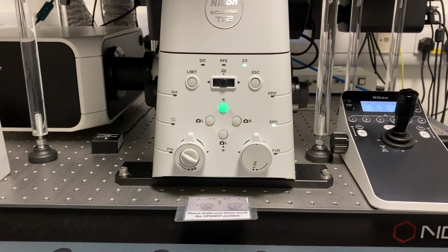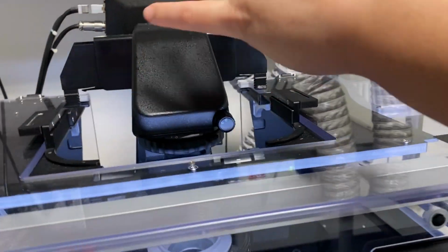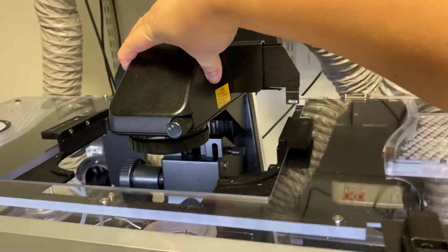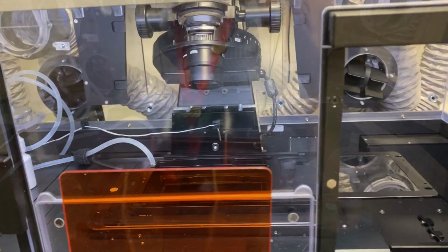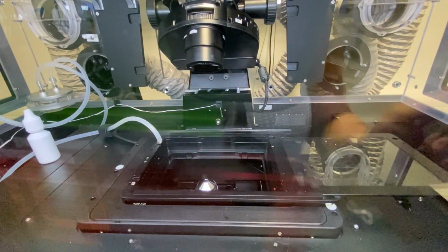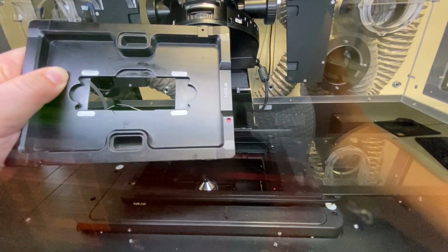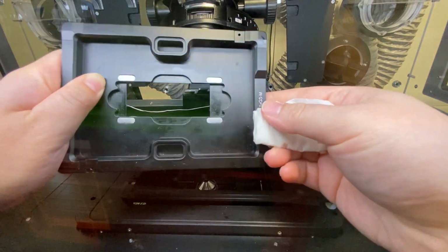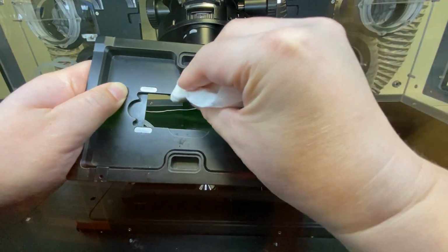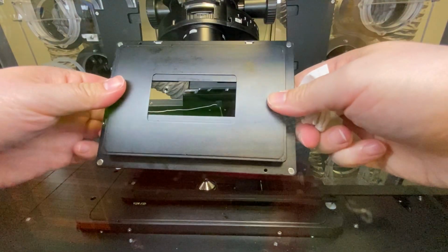So now we are ready to load our sample. You can push the condenser back to give yourself a bit more room. Please do this gently. Before putting in our sample, we need to insert the sample holder. So please make sure your lens are all the way lowered to the bottom. And if there are oil on this, please give it a clean with tissue and ethanol, especially at the back.